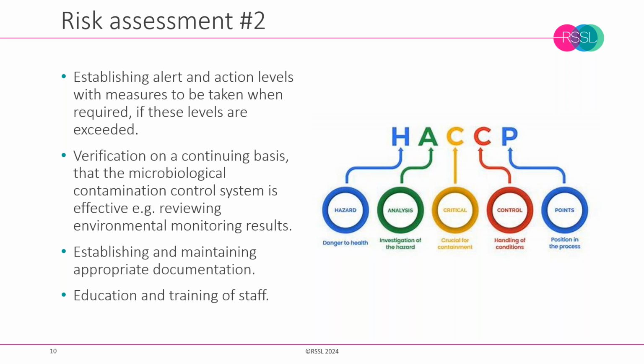Annex 1 is also signalling that we need to be mindful of what happens during maintenance, what happens prior to a shutdown and coming out of a shutdown, and also in our understanding of the frequency and suitability of cleaning and disinfection practices.